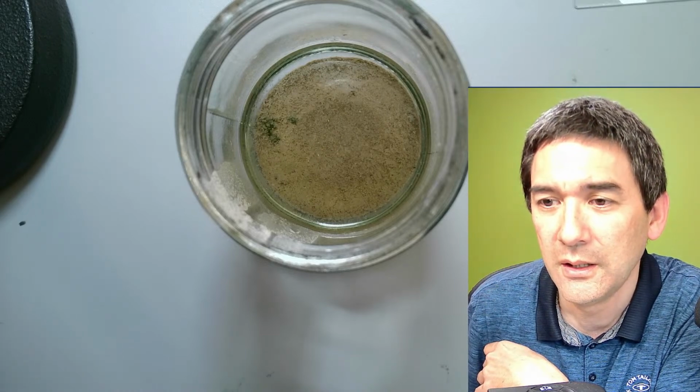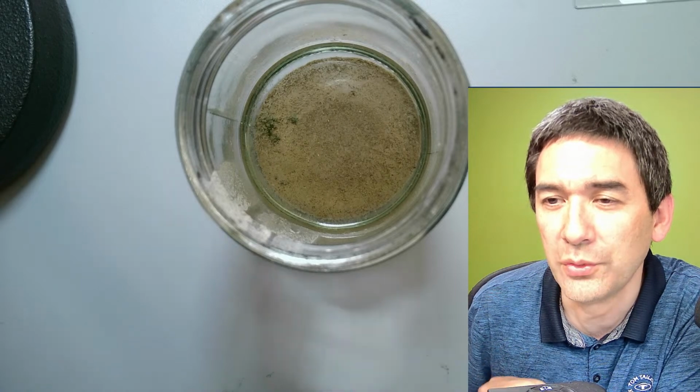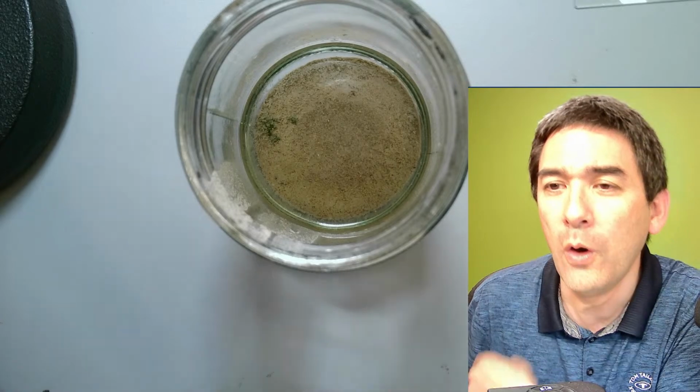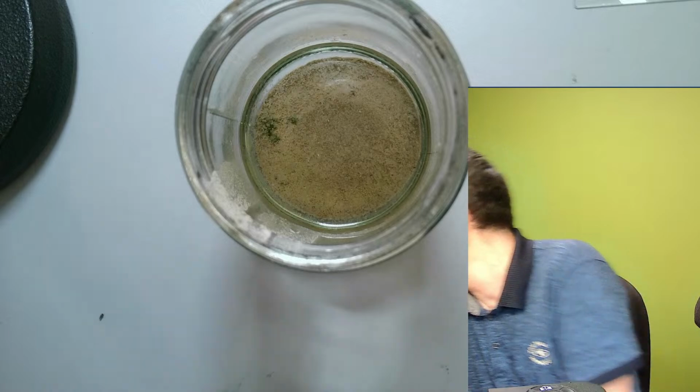So I put a flexible silicone tube between the micropipette and the tip. I hold the tip in one hand and the micropipette in the other. Oh, that's an interesting one. So the idea is the following. Do I have a tube here?